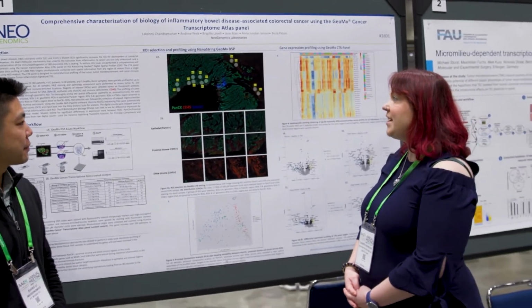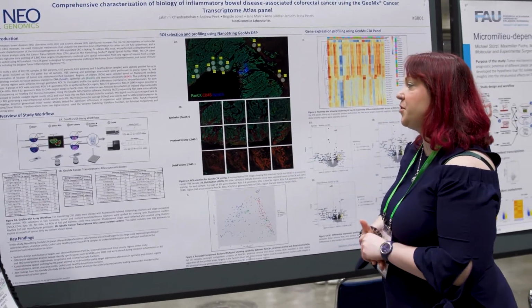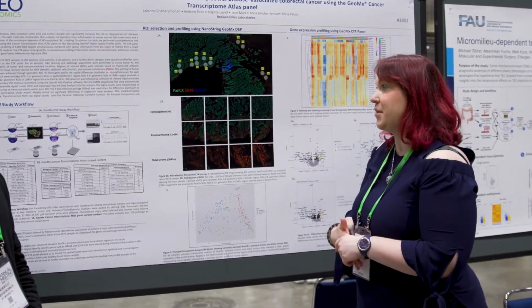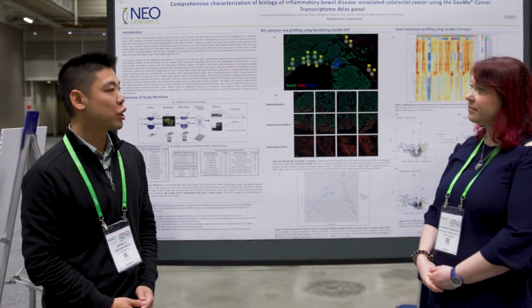So what is the next step for this? I know that you used the Cancer Transcriptome Atlas, but as you know, GeoMx now has the ability to profile the whole transcriptome. So is that something you might be doing in a different study? Absolutely. We're very interested in doing a whole transcriptome atlas.